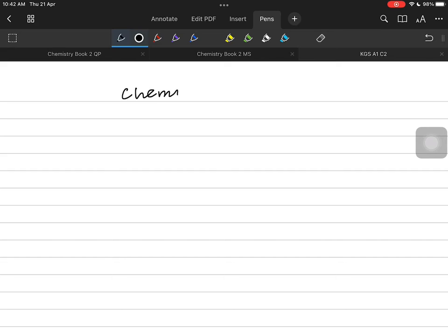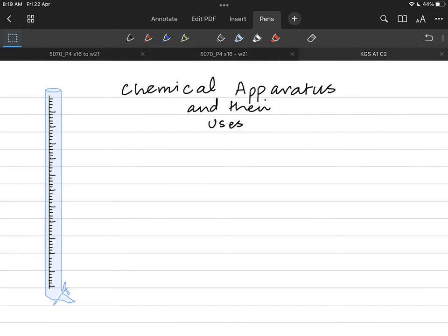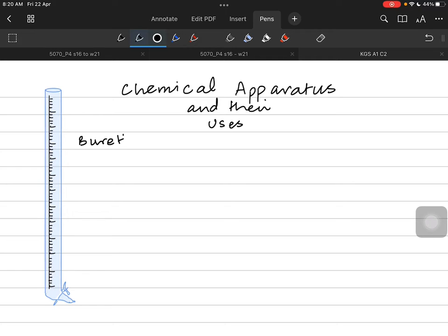So we were studying experimental chemistry. In today's video, we're going to be talking about some chemical apparatus and we're going to see where we use them and why we use them. So today's video is going to be about chemical apparatus and their uses. The first one we have over here is a burette.